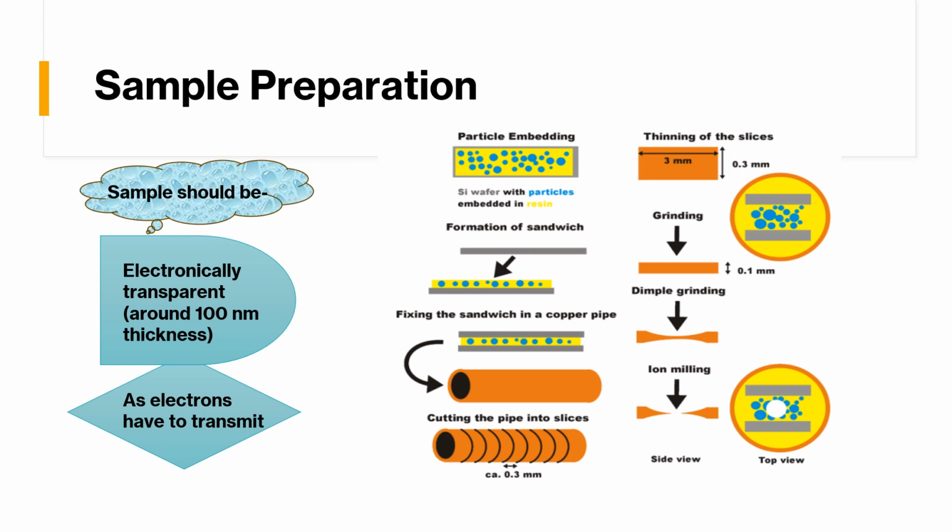So this has to be done very quickly and very carefully. After knowing all this, the principle, the sample preparation, and how the contrast is generated, we will be discussing how metal organic frameworks are imaged by using this technique.